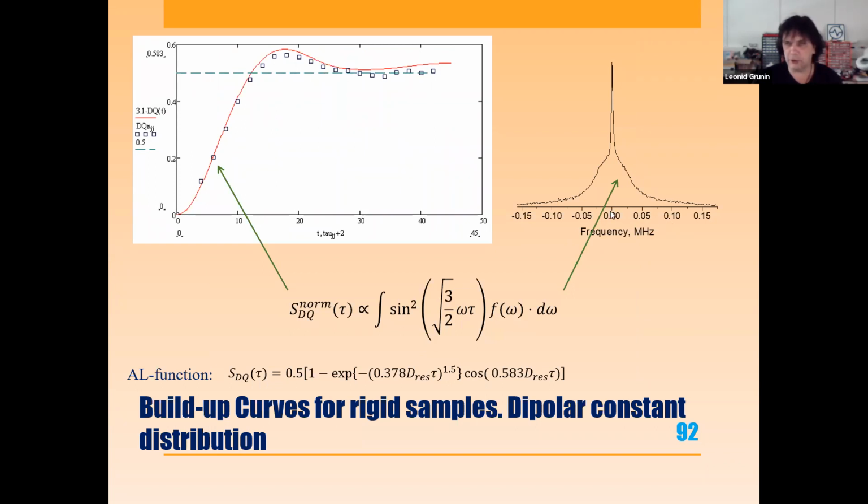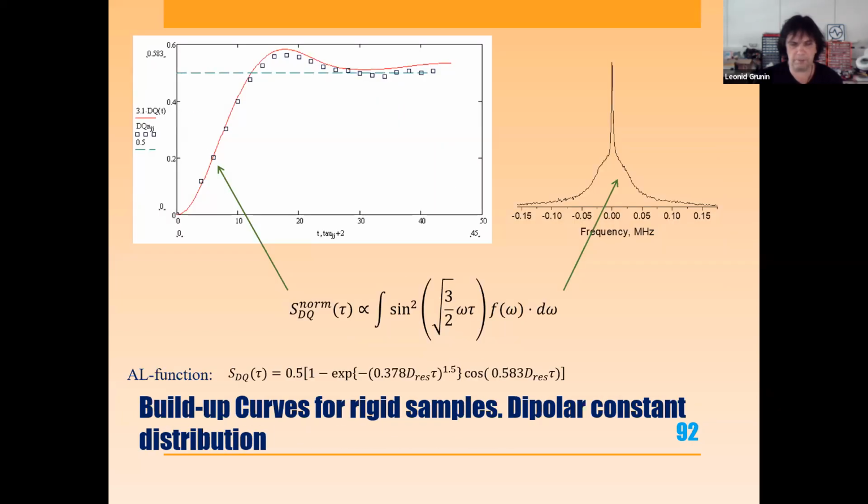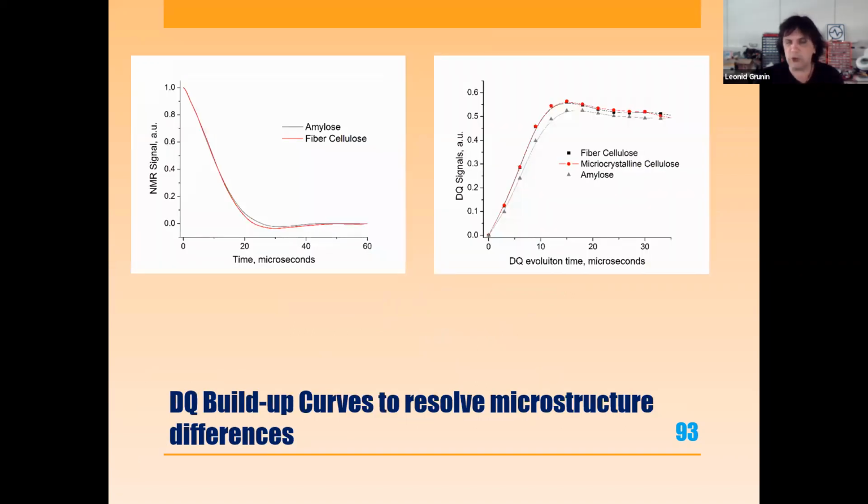So in case we are not able to obtain the spectral resolution, we can use double quantum to look at the distribution of the dipolar constant. This is important. The really perfect professor Kay Saalwächter is offering a so-called Abragam-like function to fit these types of curves, but it really works more for soft polymers like rubbers. What can we get from double quantum experiments?